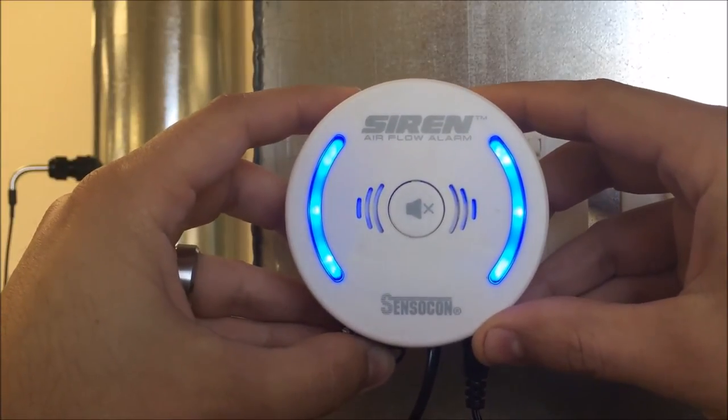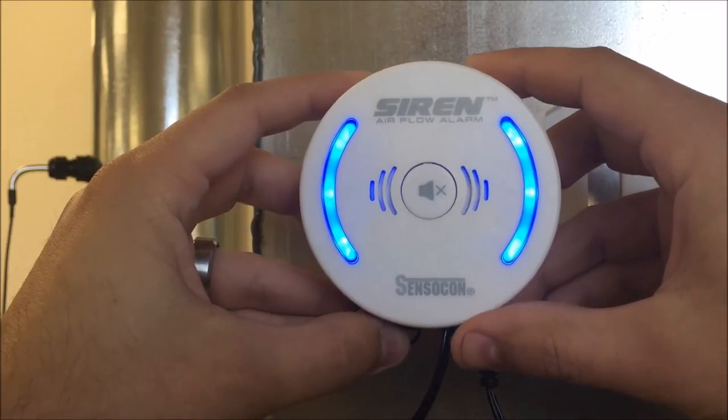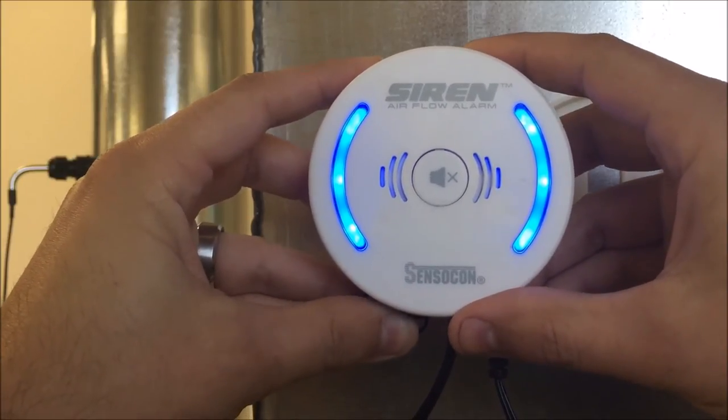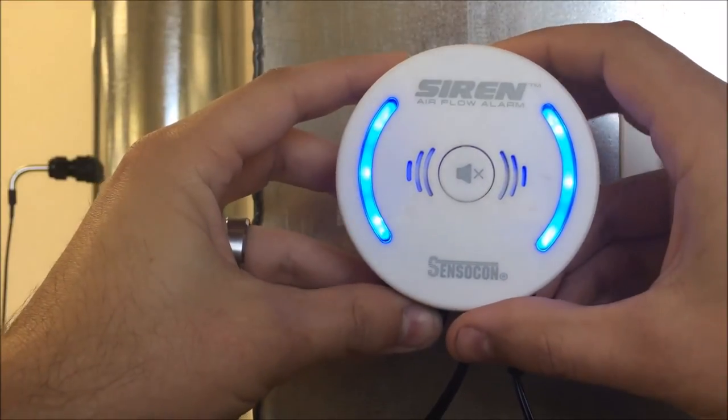Once the siren enters night setback mode, the LEDs will turn a bright blue. After returning to normal operational status, the siren LEDs will return to a solid green or flashing red depending on current air velocity.